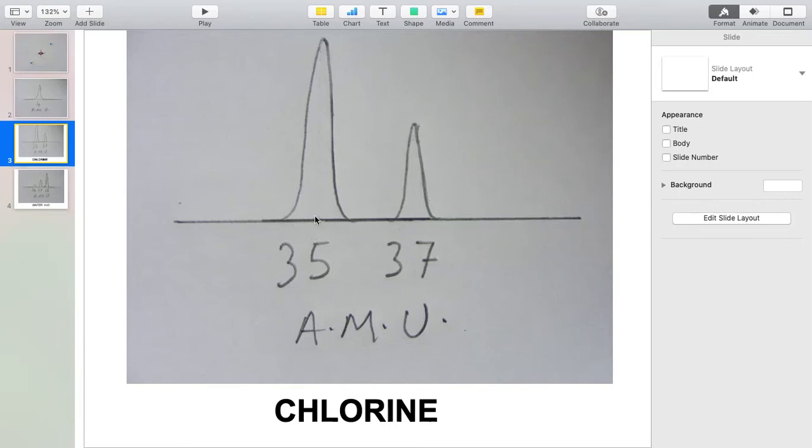But there are only so many integer masses, of course, and since there are absolutely billions and trillions of different compounds that can be made from the elements in the periodic table, there simply aren't enough integer numbers of atomic mass units to go round. So you might think a mass spectrometer isn't going to be able to identify all these different compounds. Well, there are other ways that a mass spectrometer can do this.